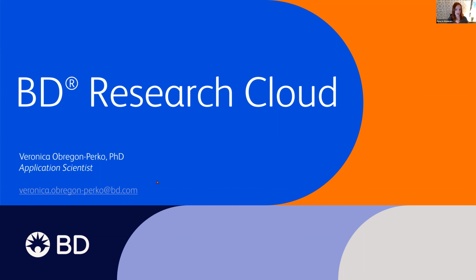And with that being said, I think I'll go ahead and get started. For those of you who've never seen me on these webinars before, my name is Veronica Obregon-Perko, and I'm an application scientist with BD. Most of the time I spend my day talking about FlowJo, our flow analysis software. But as I mentioned, we're going to be talking about the BD Research Cloud today, a platform for supporting your flow cytometry studies.